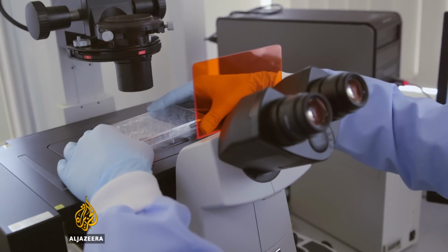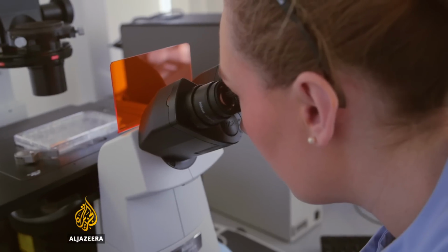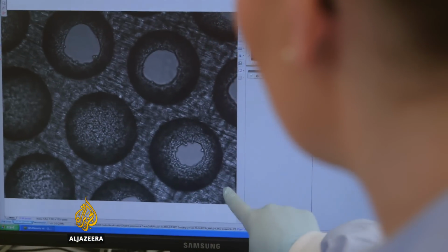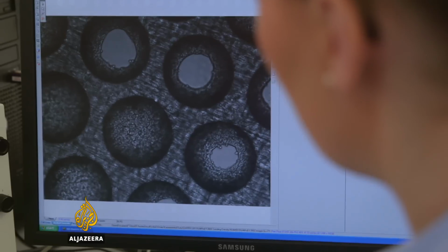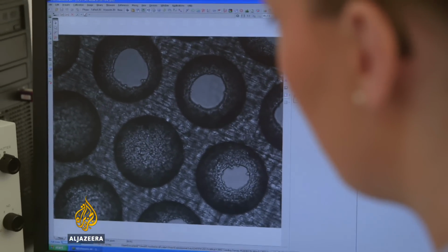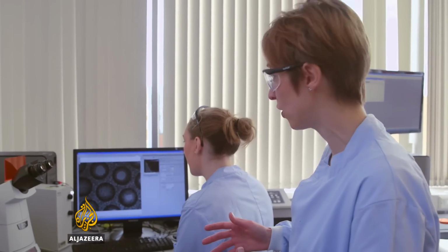So the test that we're doing here is like the equivalent of a biopsy, is that right, in terms of looking at a sample of tissue from the liver? Yes, so Emma's taken one of the liver chips out of the plate in the lab, and you can see that within the scaffold there is a regular array of channels, and these are filled with liver cells. So in fact, the good news here is that the drug has had no negative effect on the cells. The cells in this image are very healthy looking.